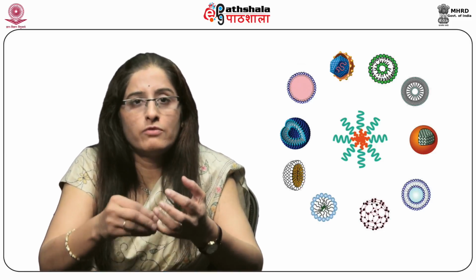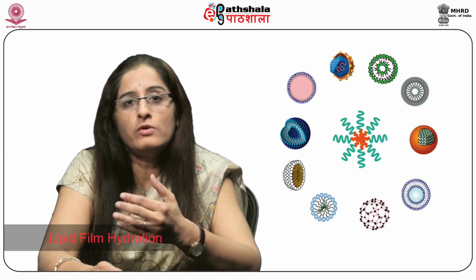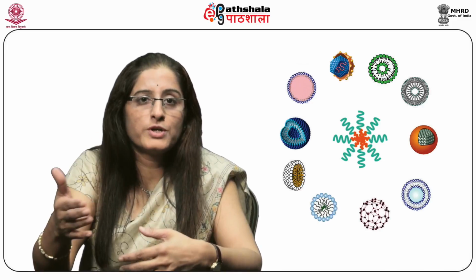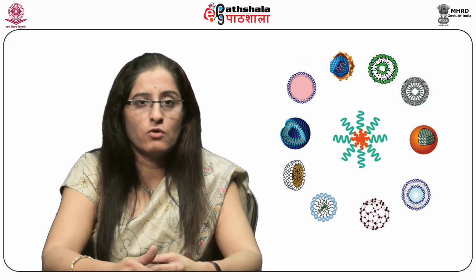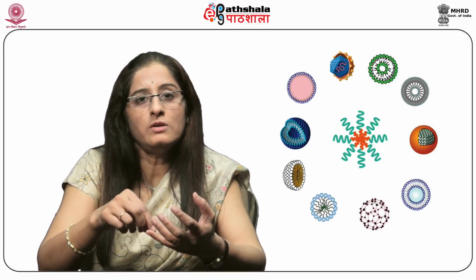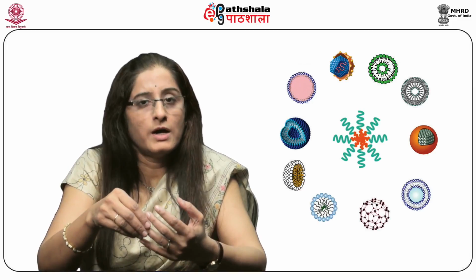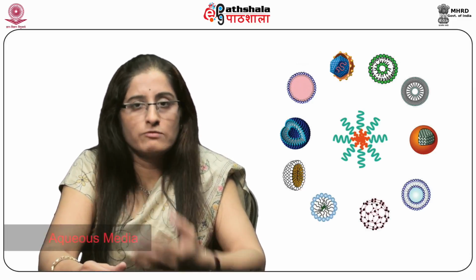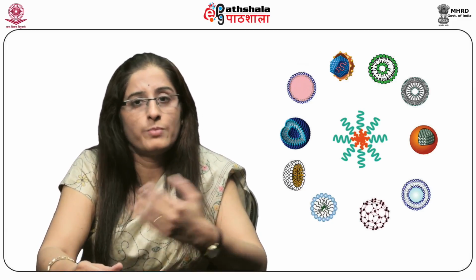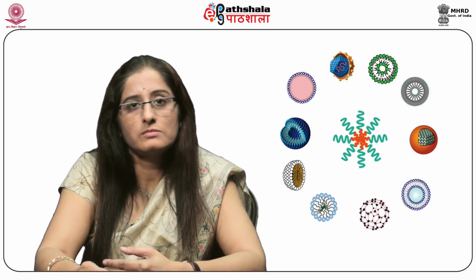Let us start with the first approach, that is lipid film hydration method. Lipid film hydration technique is the most commonly used method for preparation of liposomes. It involves following three basic steps. First, preparation of dry film of lipid. Second, hydration of lipid film in aqueous media. Then the third is size reduction of the prepared large unilamellar or multilamellar liposomes.